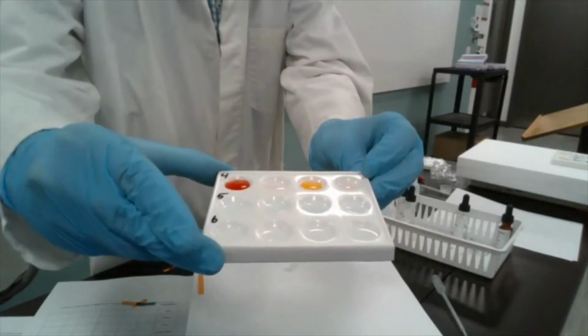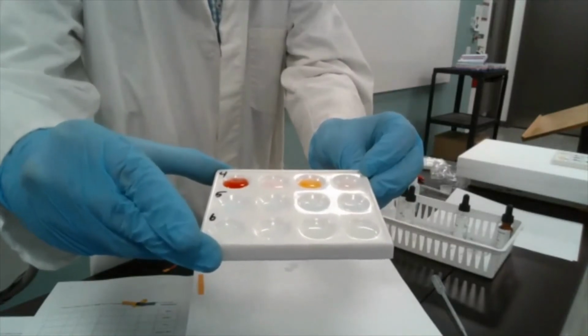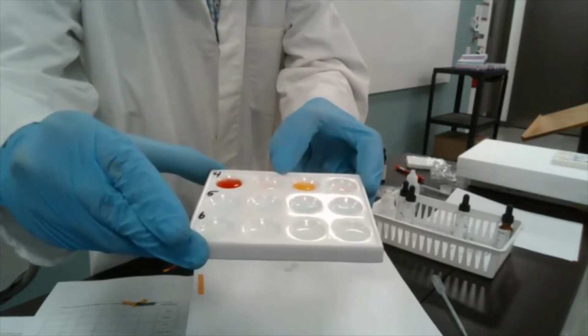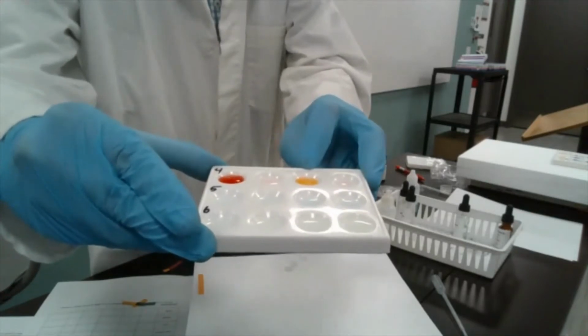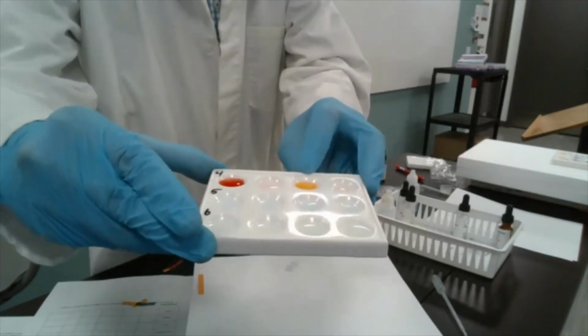So this is grapefruit juice number 4. The first one is blue litmus and it turned red. Phenolphthalein remained colorless. There's a hint of pink, but that's the color of the grapefruit juice itself. Bromothymol blue turned clearly yellow.